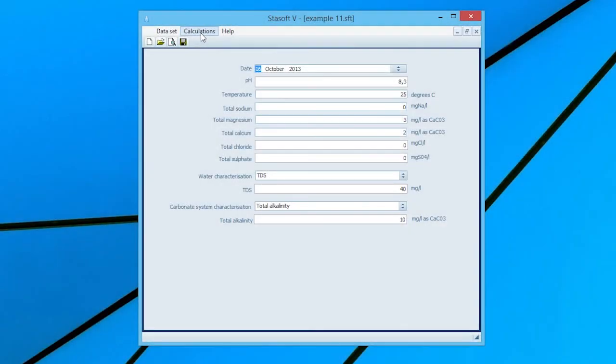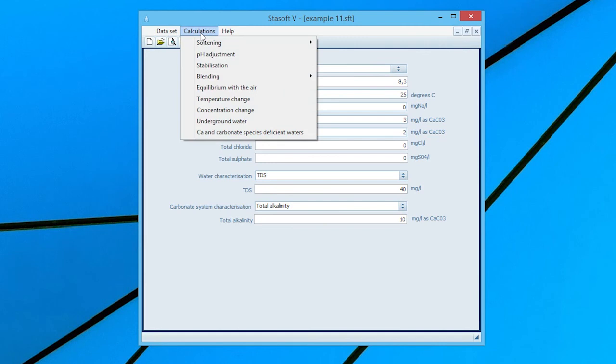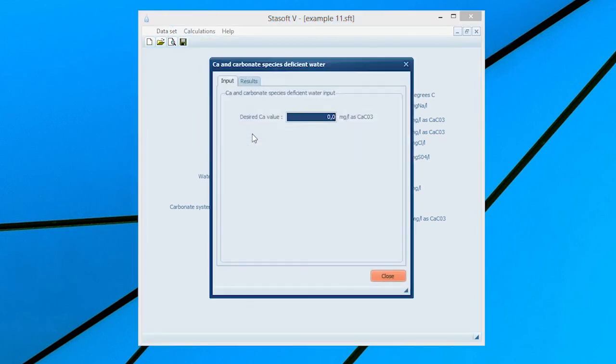Close the window and select the Calcium and Carbonate Species Deficient Waters option from the Calculations menu, bringing up the Calcium and Carbonate Species Deficient Waters input window. In this particular case, because the calcium concentration is less than the total alkalinity value, only the input box for the desired calcium value appears on the screen.